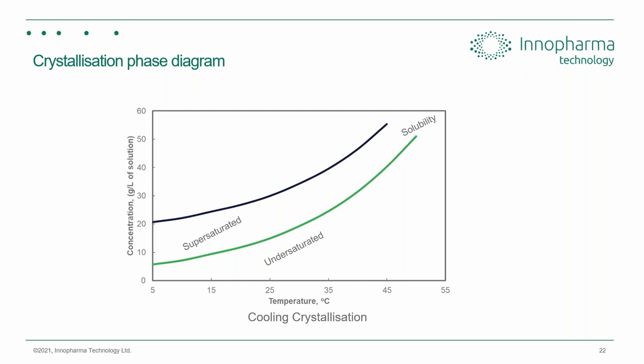So what happens then? In fact, there are other ways to induce this. If we're not careful, for example, even if it's extremely high temperature, or say we've been very careful with cleaning our instruments and so on, even a simple knock can cause something that's oversaturated to nucleate. So what we're going to do today is go to high temperature and just by lowering the temperature again with the same concentration, we're going to cause nucleation.